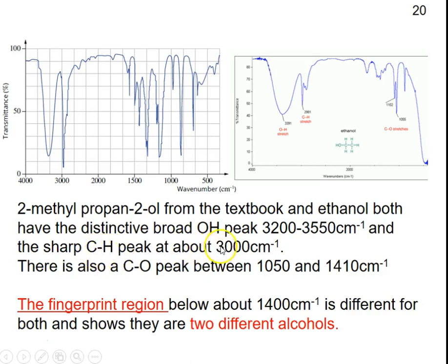So if you look in your data booklet, you can see these peak wave numbers. This is present on all hydrocarbons. Every single hydrocarbon has a carbon bonded to a hydrogen. So you get this peak around 3,000, and it can help you work out this hydroxyl peak, which is just above it. Okay, and that other one around 1000 is hard to find here.